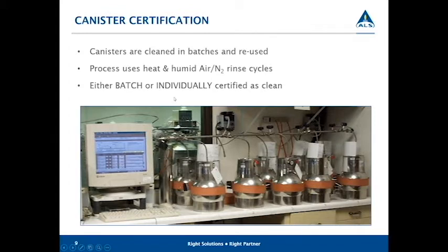Individually certified means that we individually pull off each can and analyze them on the instrument to make sure that each individual can is clean. That process takes a little bit longer, and it's more expensive to get individually certified clean equipment.